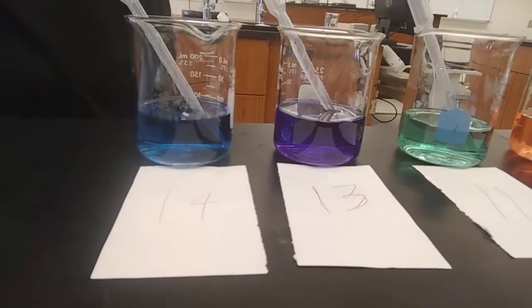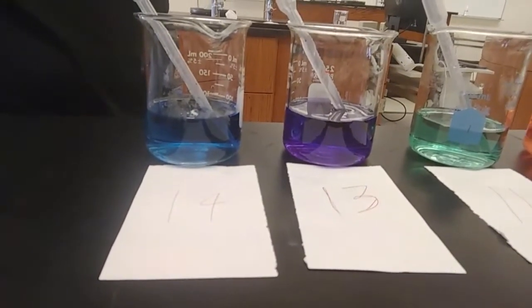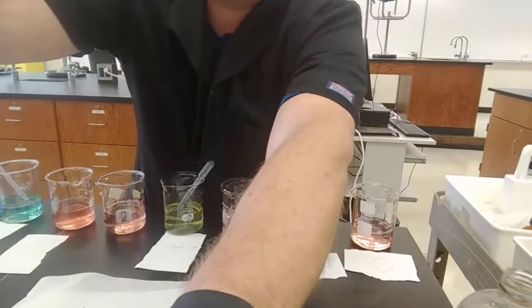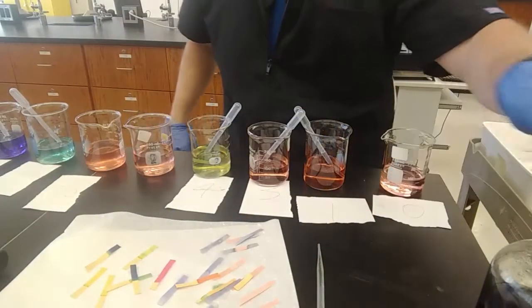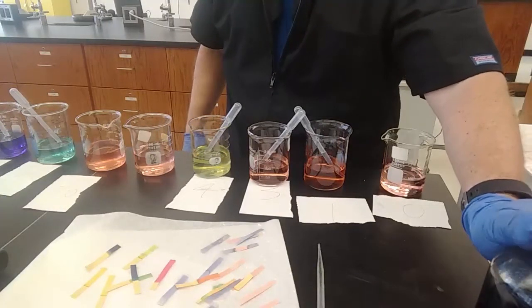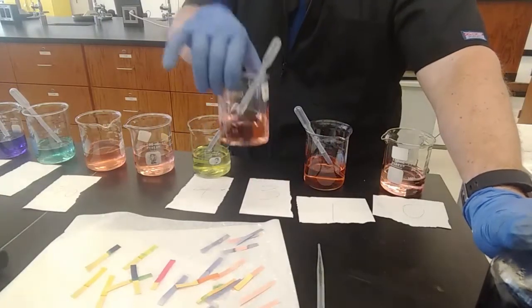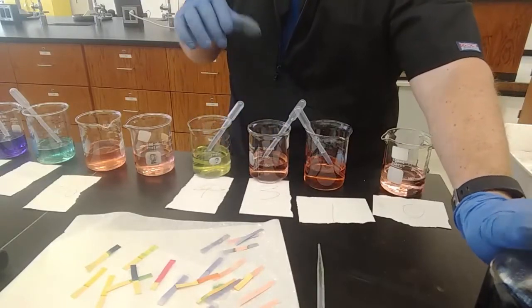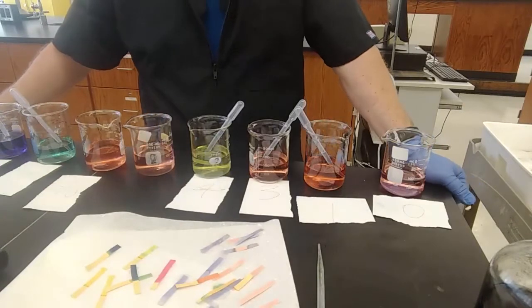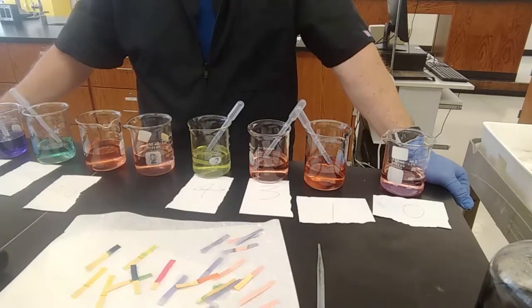So what are you getting out of this lab? What can you conclude from this lab? Well, I think that this is a nice example of how data can vary depending on your instrument. It can be subjective based on how you name each color. You don't have to name them what I named them. You might call this tangerine instead of peach. I don't care. And how you might need to use multiple instruments to confirm your results and maybe repeat the experiment.